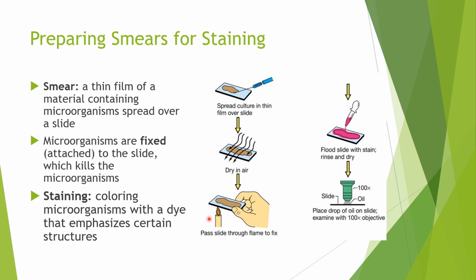Now this step right here, we call it fixation. You're going to fix your microbes. What does that mean? There's nothing broken with your microbes. What does it mean, I'm going to fix my microbes? That means that you're going to attach them to your slide. That's the term we use, fix. So fix meaning you're going to attach your specimen to the slide. How do we do that? How do I attach my specimen to the slide?